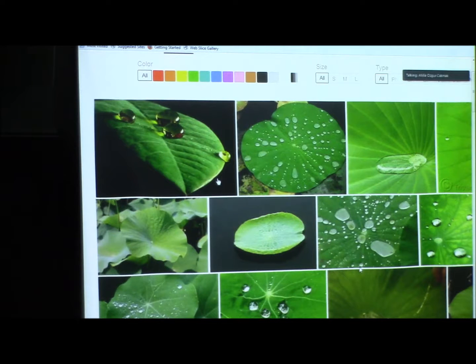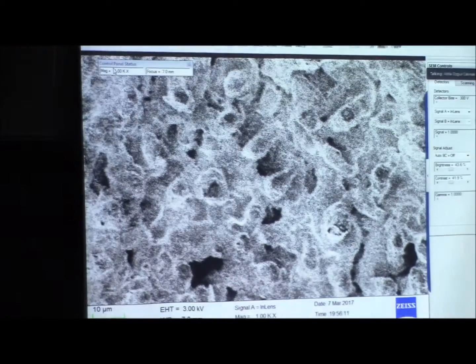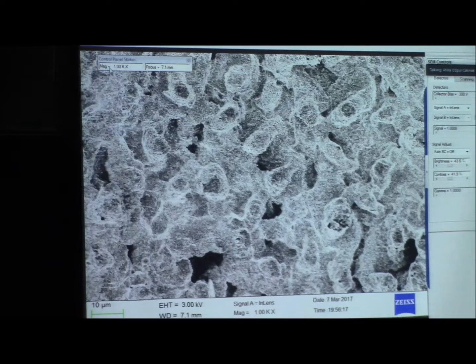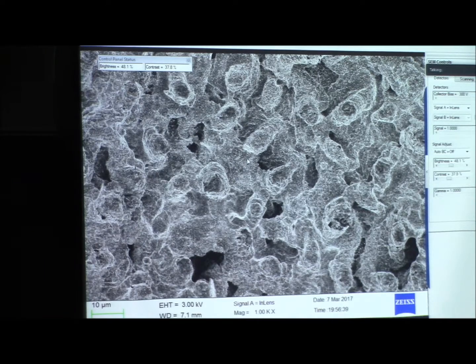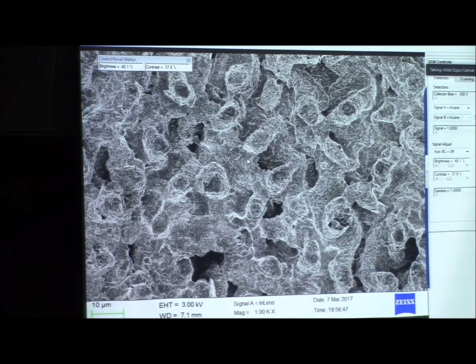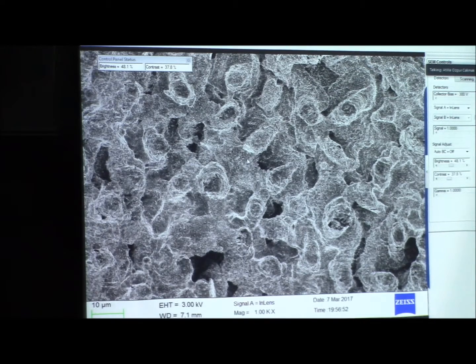So does anyone of you know why this happens? Yep. Okay, so we're gonna take a look. Okay, cool. Let me refocus real quick here. Do you see, you guys, in here that there are different bumps? Like, I'm gonna move the mouse like this, here, here, here. They're like pimples on the surface, right? They have micron-sized bumps on the surface, right?